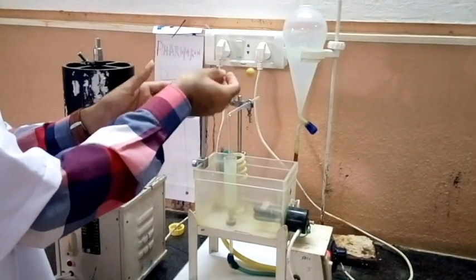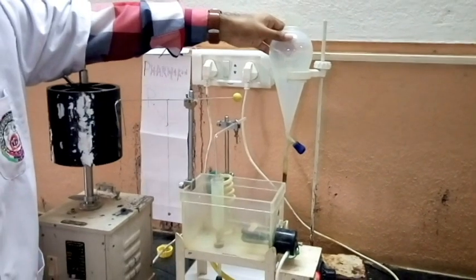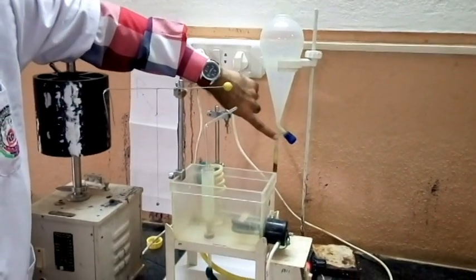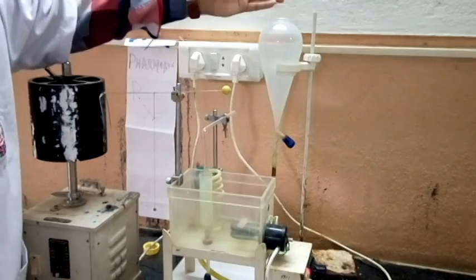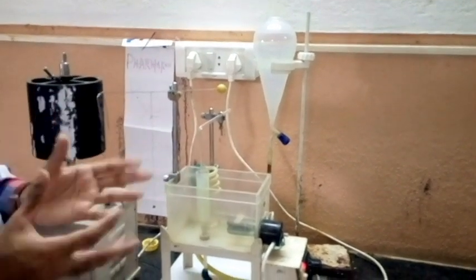There is also the reservoir which contains physiological salt solutions which, upon opening the clip, the physiological salt solutions come and enter into the inner organ bath where the tissue is there.